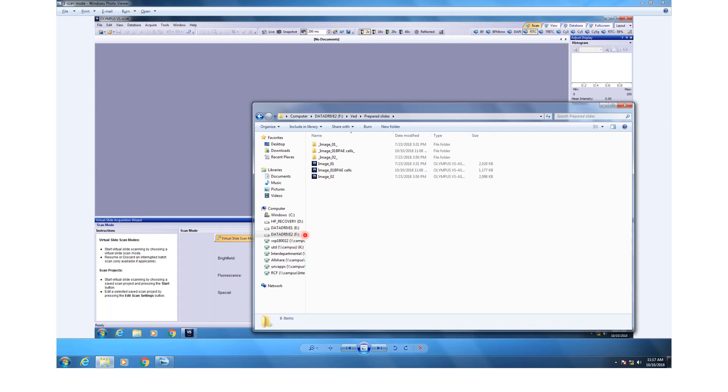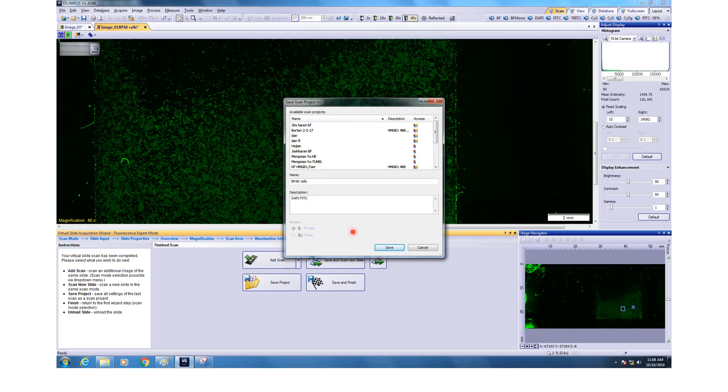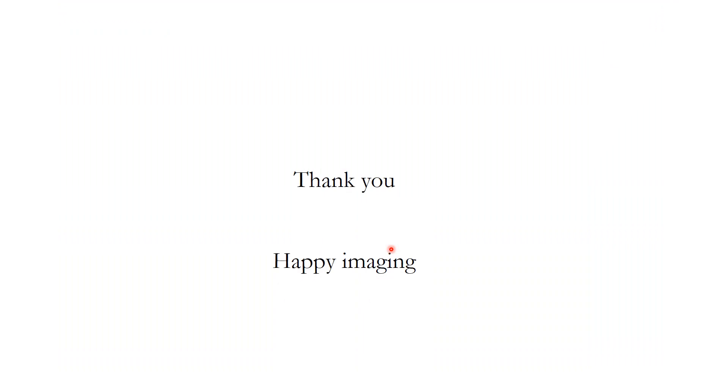When you want to finally take the data, you can put it in the interdepartmental RCF users and your net ID. And with that, we have come to the end of the module. And this is where you can actually save the project. If you click this, then you can save the file name. I have used BPAE cells because these were the cells that I used for imaging and I can save it for my future needs. And I can also use this project for doing batch scan like we did for the bright field imaging. With that, we come to the end of module number two and happy imaging.